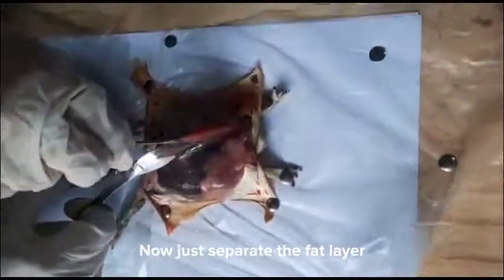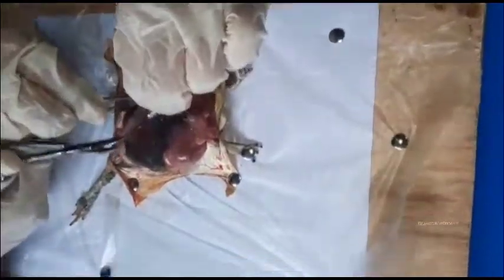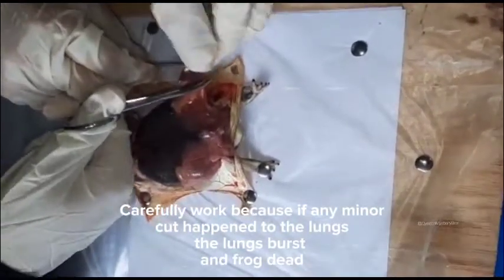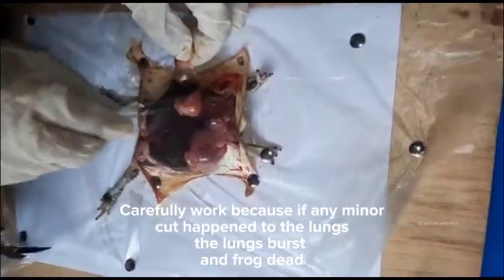Now just separate the fat layer. Work carefully because if any minor cut happens to the lungs, the lungs burst and the frog dies.